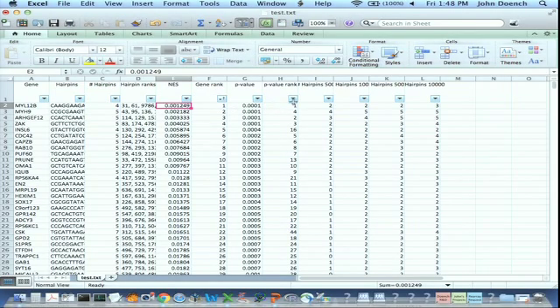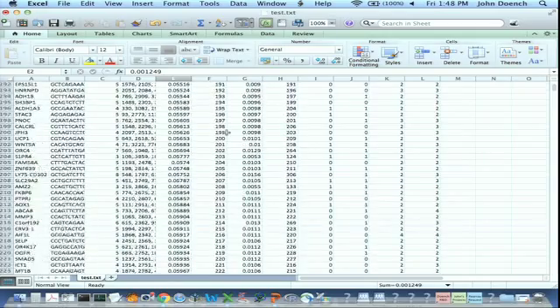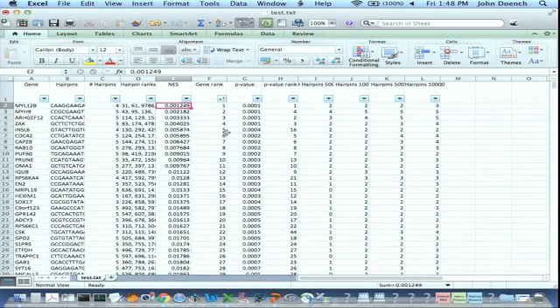You also get a p-value and a p-value rank. The p-value will obviously relate to the number of permutations you did, how small your p-values can be. If you only did 1,000 permutations, you can only get a certain p-value. You'll notice that the gene rank and the p-value rank are not identical, but they do track quite well as you scroll on down, which is totally what you'd expect. It's just slightly different ways of calculating. I always use the gene rank determined from normalized enrichment score, but that's not going to push your results one way or the other. But I prefer to use the gene rank.